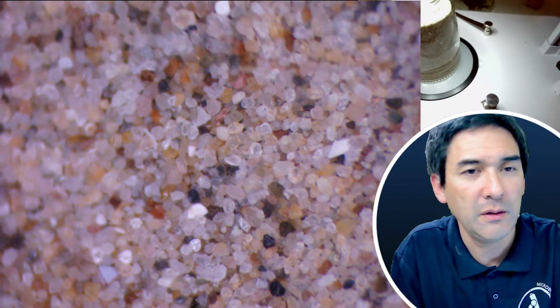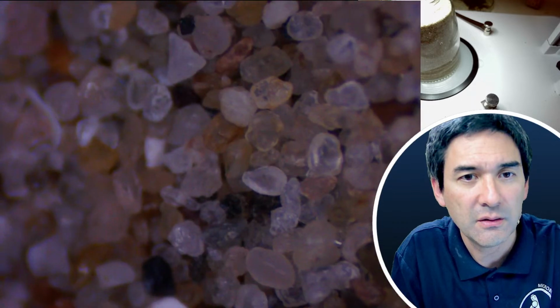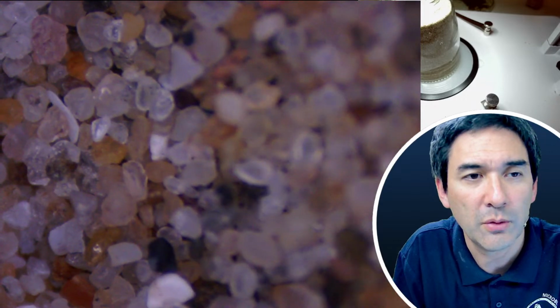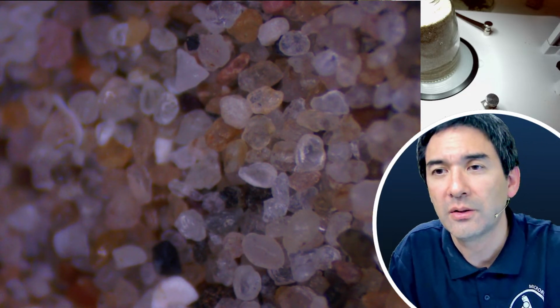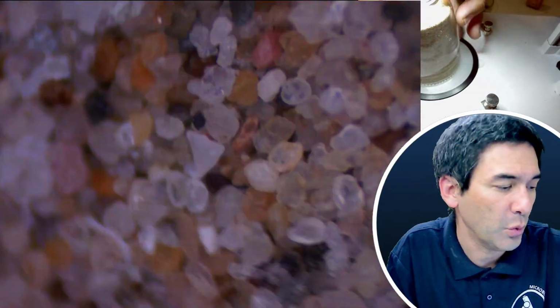Let's have a look. Is this natural sand? It looks a little bit more like it has slightly more corners here. No, but I remember this beach was a natural beach as well. This is a beach in Noordwijkerhout.